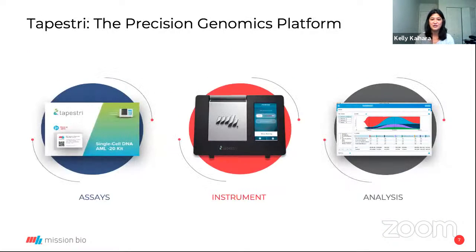So Mission Bio offers a complete end-to-end solution. We have all of the assays in order to look at DNA plus protein. We have the instrument and the microfluidic chips in order to put cells and droplets in a high throughput fashion and get to the DNA and the protein signature for thousands of individual cells. And again, we worked really hard, and this is what most of the presentation is going to be about, which is data analysis, the really exciting graphical depiction of what is lying in your sample.